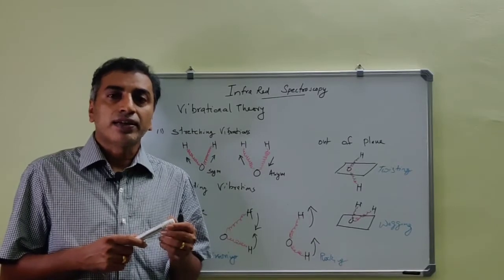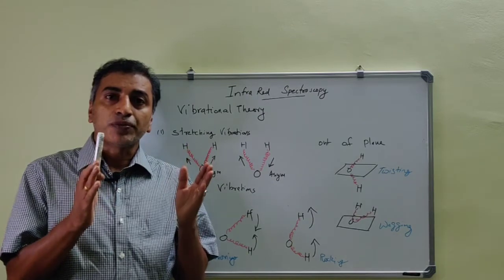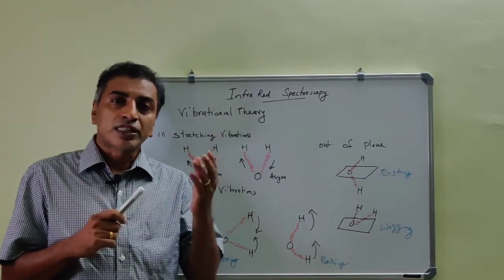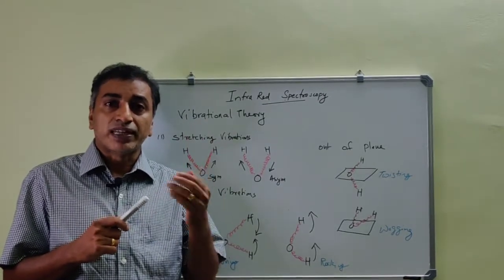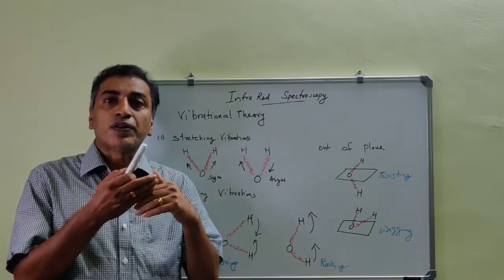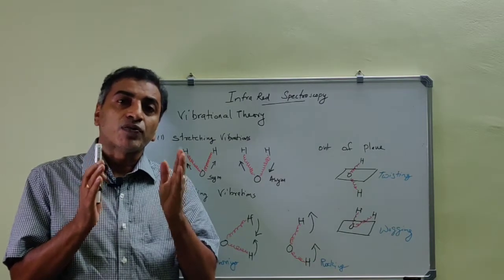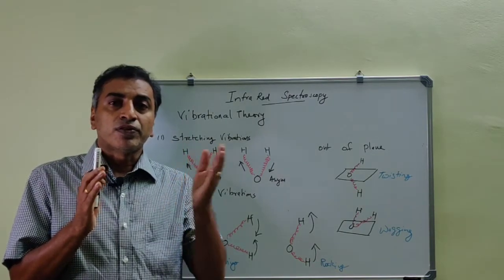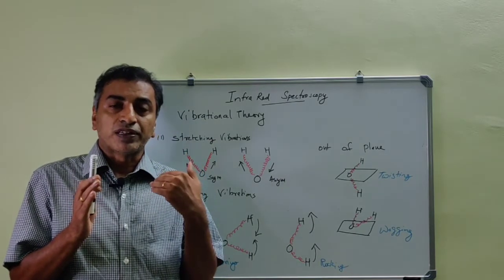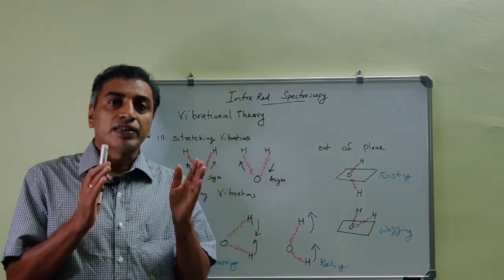Why are we taking IR radiation in frequency or wave number? Because IR radiation occupies a wide range in the electromagnetic spectrum, and decimal values come when you take wavelength in micrometer. That is why we take the reciprocal of wavelength, the wave number, so that we get whole numbers. If we are concerned with the middle infrared, which is most common in our pharmacy field, or which most of our pharmaceutical drugs absorb, we will get a whole number.